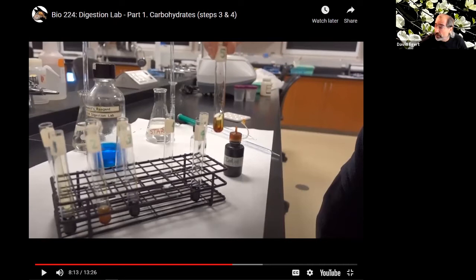This is the one where we had just maltose with no starch. We can see the Lugol's does not react. It just stays kind of yellow brown.